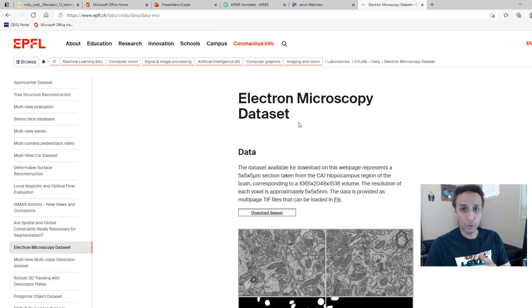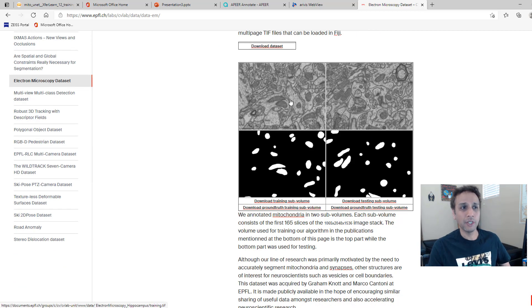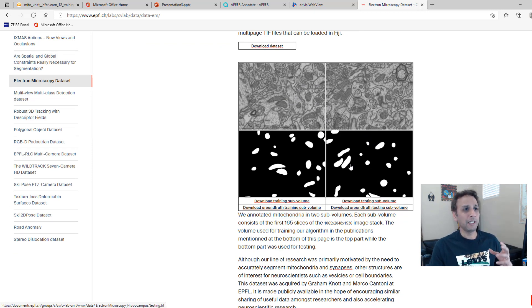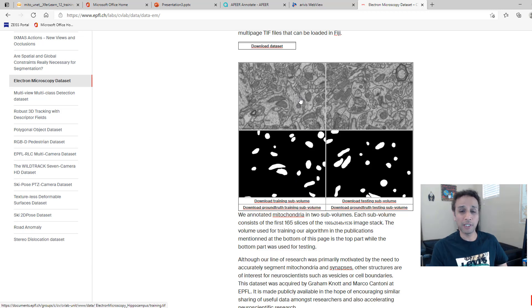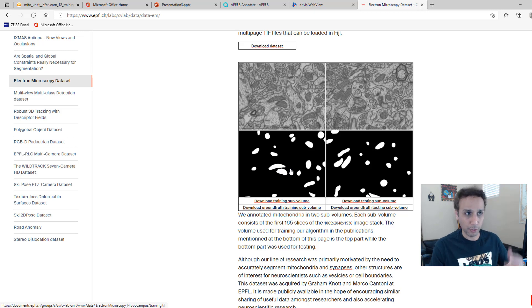On your Google search, go ahead and type 'electron microscopy data set' and also add the keyword EPFL. It'll take you to a page where each image — when you download these images and corresponding masks — is 1024 by 768 with corresponding masks. You have 165 of these images and 165 corresponding masks. If you use the entire data set, that's not small data — that's pretty big. I'm going to take only 12 images and 12 corresponding masks from this data set as a starting point.